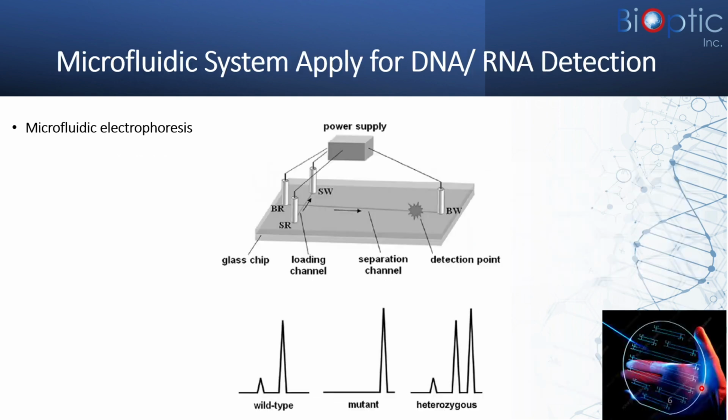In recent years, there is another popular technology, microfluidic chip. It narrowed down the long capillary into a small chip to minimize the sample requirement and decrease the analytic time severely. However, the cost of consumables is very high.